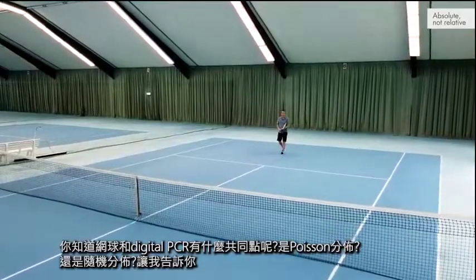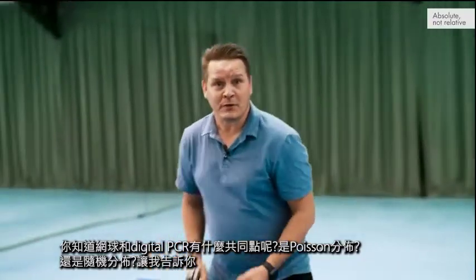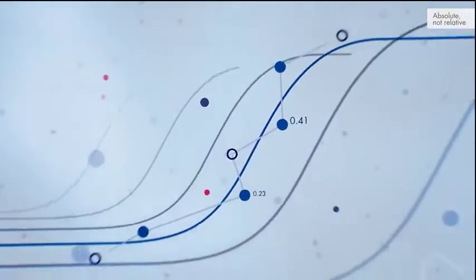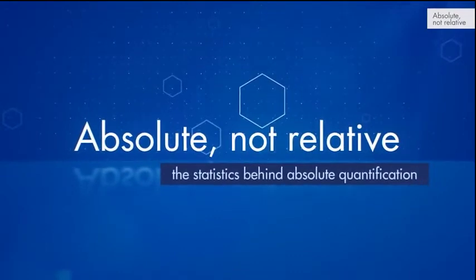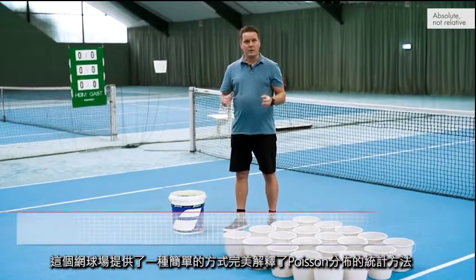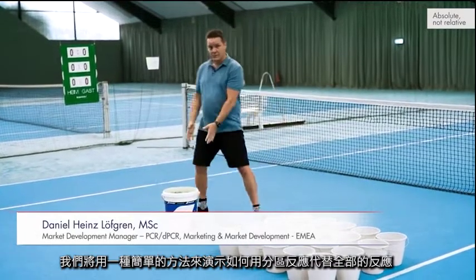Do you know what tennis balls and digital PCR have in common? It's Poisson statistics and random distribution. Let me show you. This tennis court offers a perfect way to explain Poisson statistics in a simple way. We are going to show you how we can use partitioning instead of a bulk reaction.